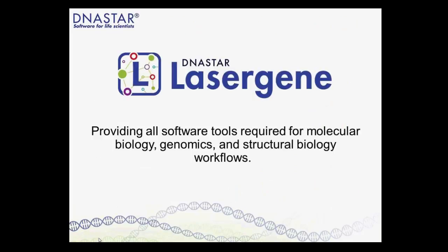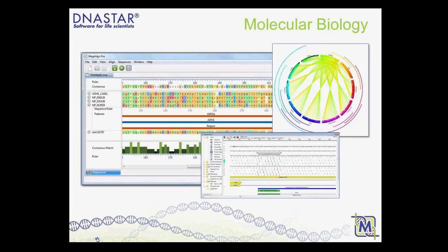Our statement here is providing software for molecular biology, genomics, and structural biology, and that just sums up what the DNASTAR Lasergene Suite is. Of course, there are different programs within the suite, and we'll focus on just a handful of them today. For molecular biology, just to give you an idea of some of the capability, things like multiple sequence alignment.